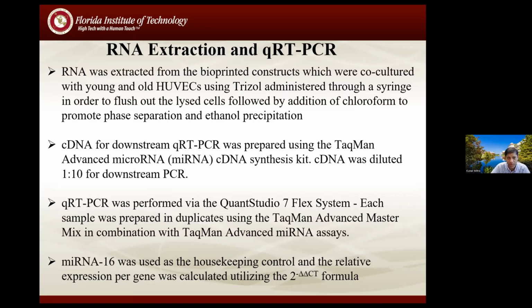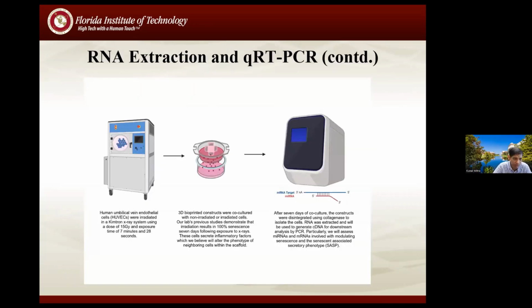We wanted to show them that we bioprinted tissue, and then we co-cultured them with the young and old HUVEC cells printed, because old means their viability will of course be less, and young is young, as the name suggests. So we co-cultured them, and then we did the cDNA and the qPCR, and we wanted to look at the expression of the microRNA just to demonstrate that these 3D bioprinted structures are going to replicate what you're going to see using an animal model, because it's a very classical approach.